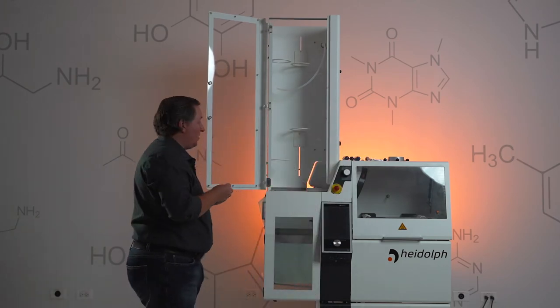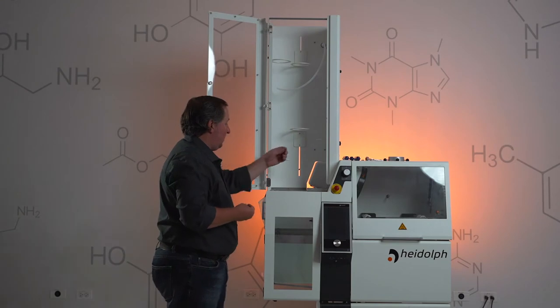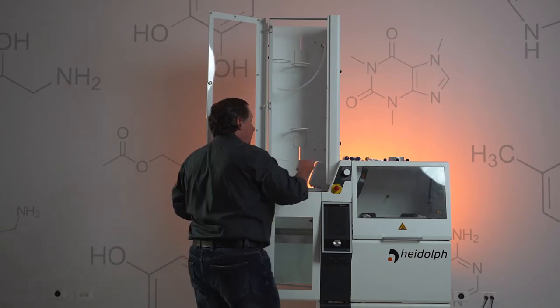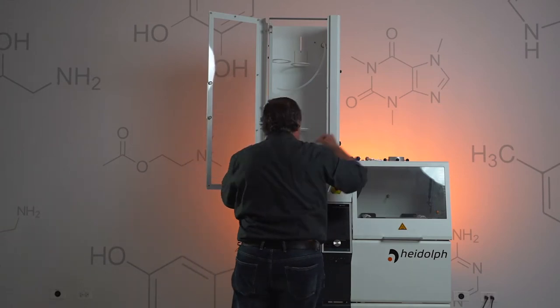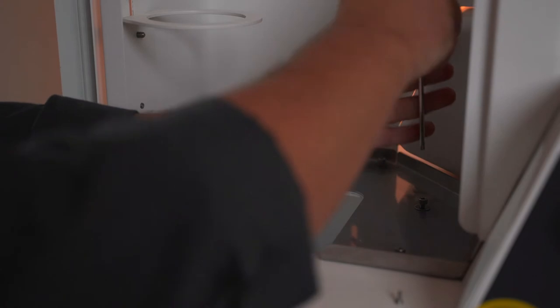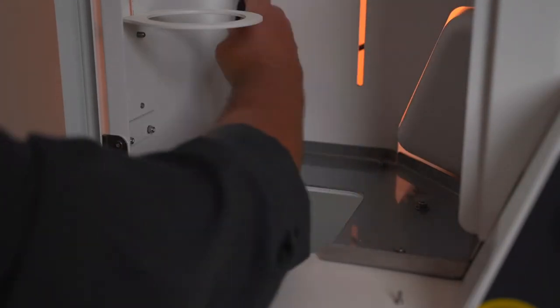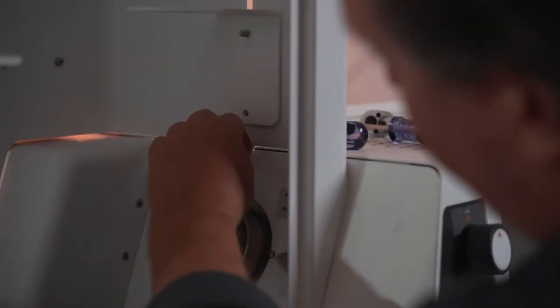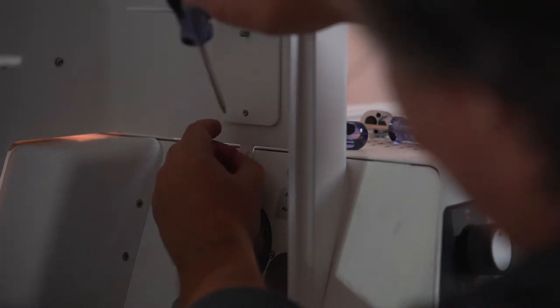Once you have everything in position, we'll start screwing the cabinet into place. Get your five T25 Torx screws and start putting them in by hand — start them by hand, it'll make the final screw-down a lot easier. And then we're going to install our little T10 retaining screw.